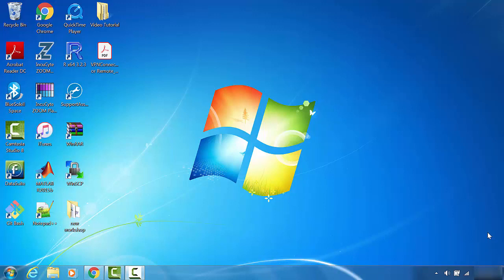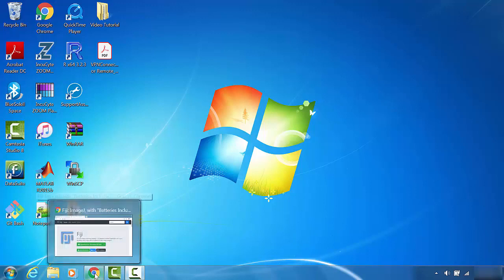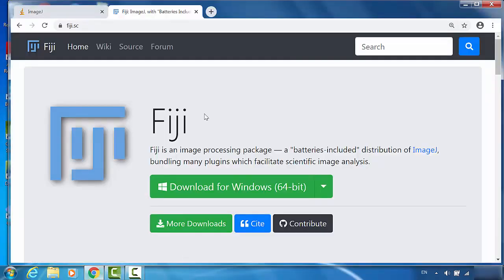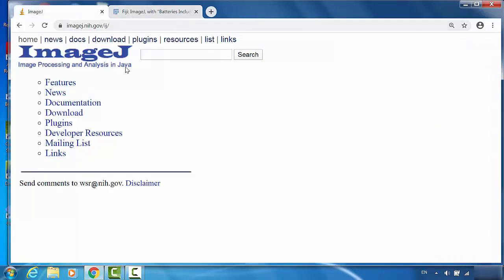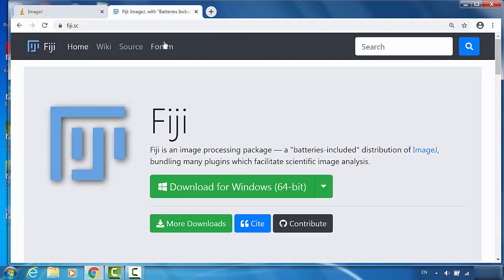For this section, we're talking about how to install Fiji ImageJ in Windows. First, we can go to the ImageJ download site. You can either download from the NIH website, which is the core of ImageJ, or I will strongly suggest you actually download from this site, Fiji.sc.